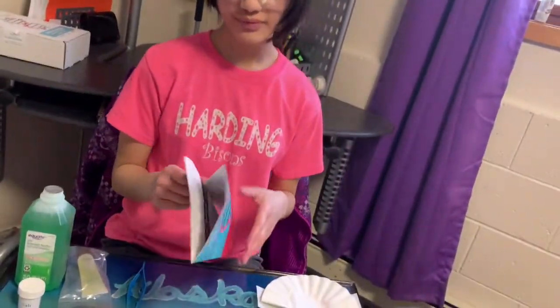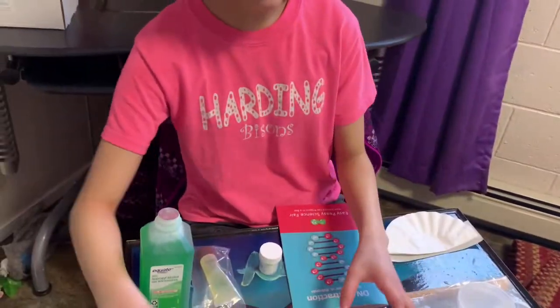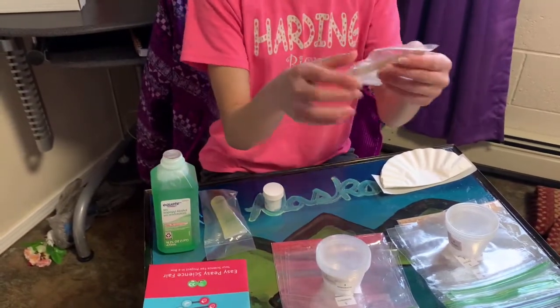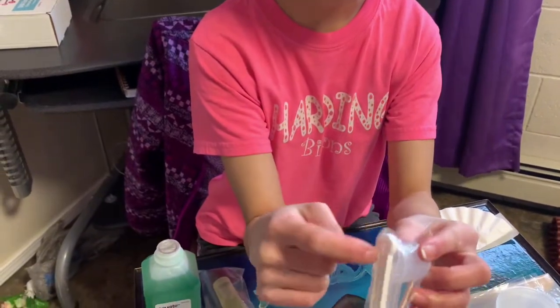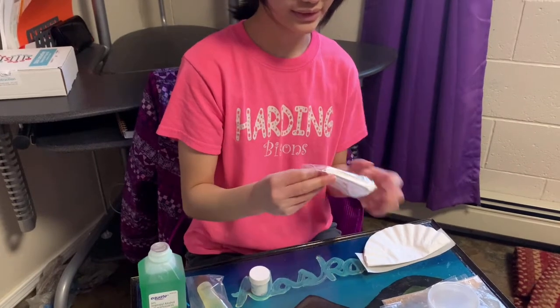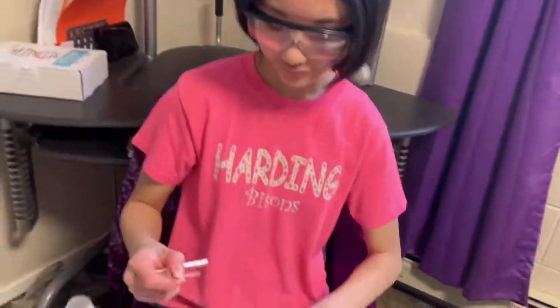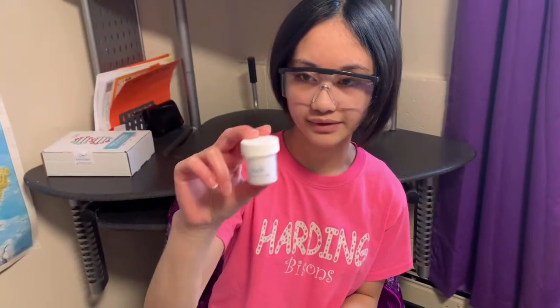So now, we're going to be adding salt, sodium chloride, into the bags. So here we have our measuring, and we're going to use the smallest measuring thing and the popsicle stick to get the extra salt out. So this is our salt. It's not a lot because we're not going to use a lot.